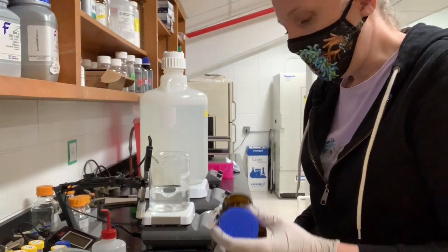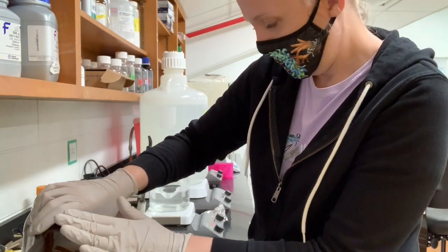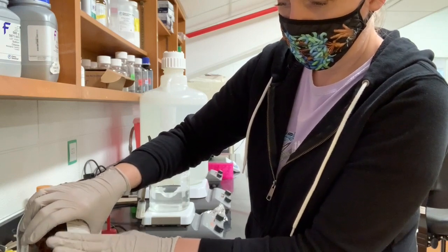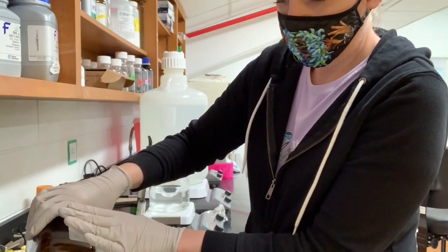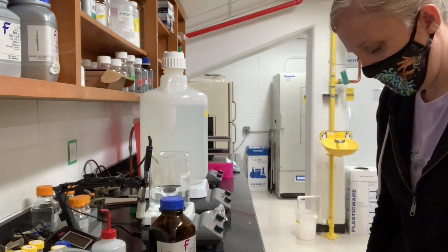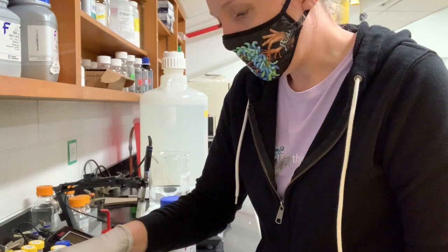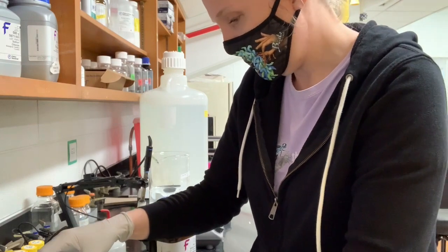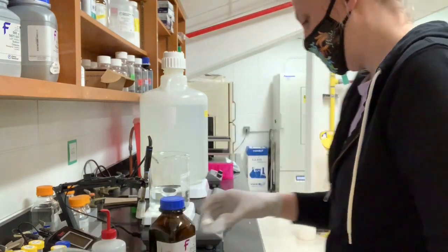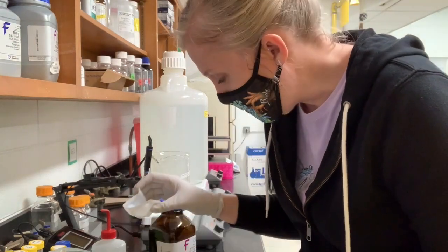So I need 14.196. This is a little bit more fluffy of a salt. Add a little extra. Again, it can feel a little wasteful to pour out more than you need and have to get rid of it, so be careful not to add too much. This might be a reason why you should use a spatula.